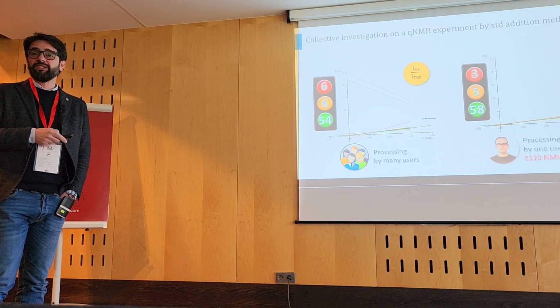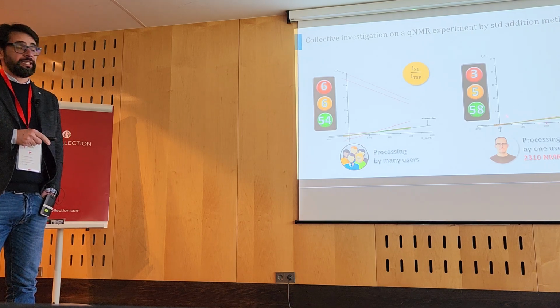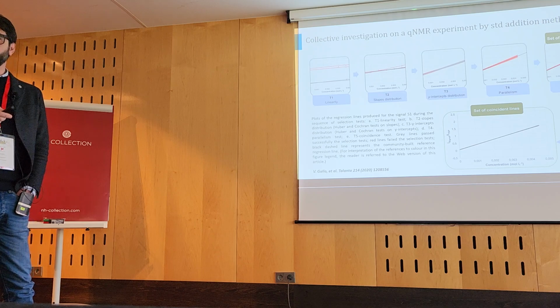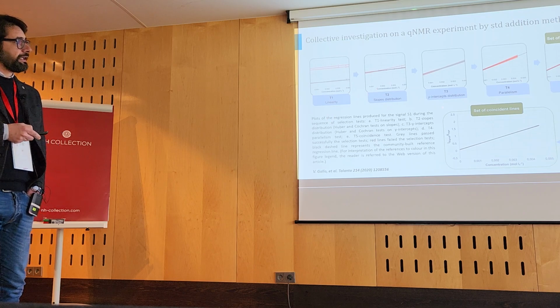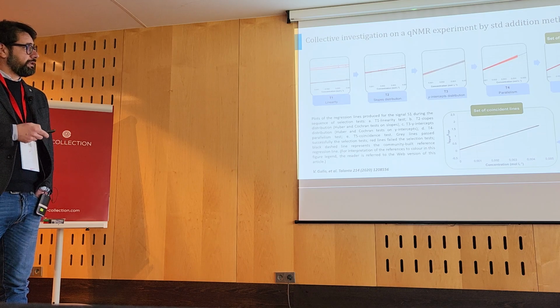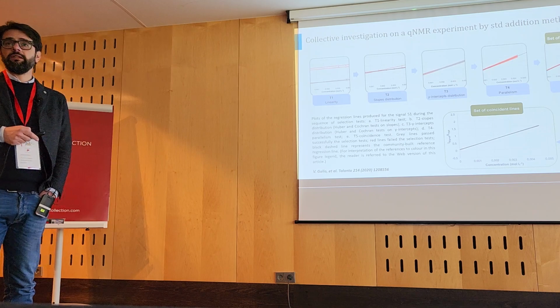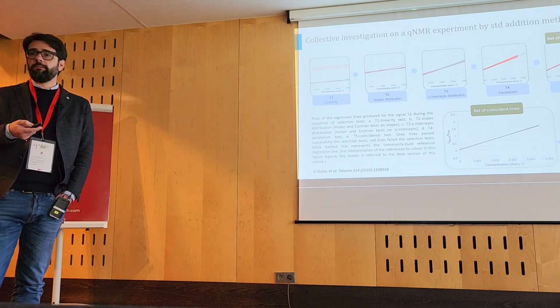Okay, the distribution: the same raw data processed by only one operator give different results in terms of coincidence of lines. We applied a statistical filter to select coincident lines and to remove outliers. The steps of linearity, slope, and intercept were selected, and then the lines that didn't respect the requirement were removed. Then we tried with the parallelism test and then the coincident test. We obtained two sets of lines and we calculated the average calibration line.